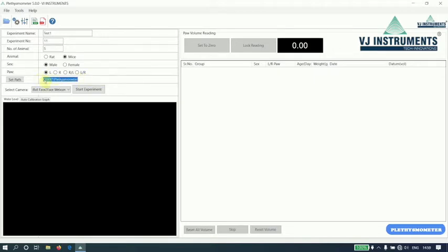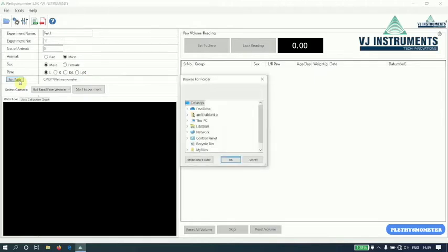This is the path wherein the reports will be saved. By default, it is set to C VJIT plethysmometer. If you wish to change it, click on set path button. A folder dialog will appear. Select the required folder and click on OK button.